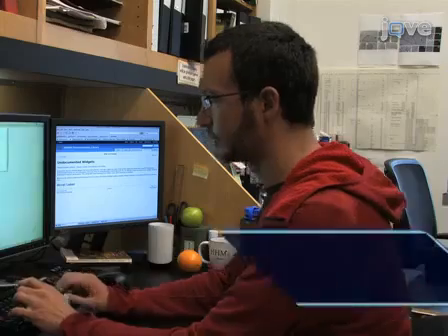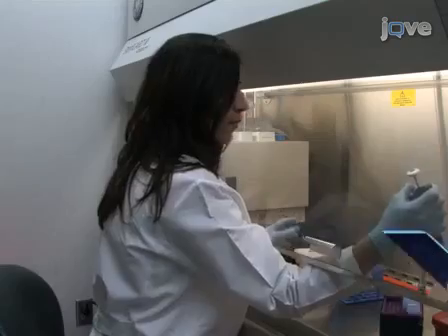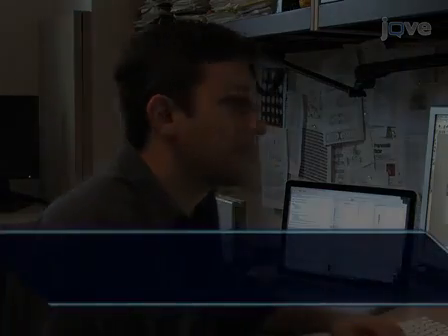Other lab members produced the computer screen captures and helped prepare the accompanying written protocol, including Beeby, Pilhofer, Jian, Zhuo, Jian, Elitza, Tocheva, and Dylan Morin.